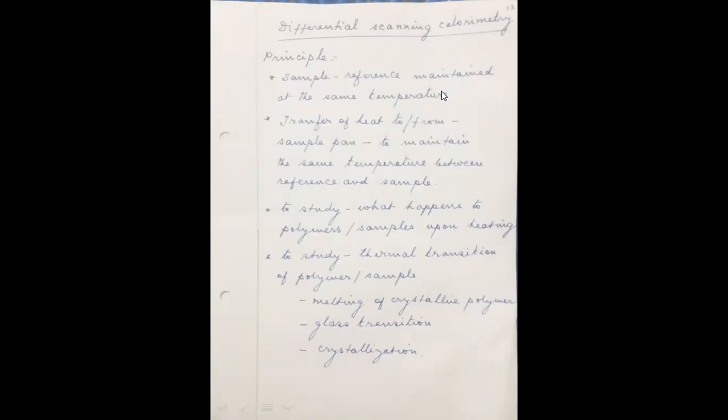And also, in crystallography, you might have studied a very important concept called glass transition. There is a temperature called the glass transition temperature. It can also be followed using this differential scanning calorimetry, and also the crystallization procedure itself.